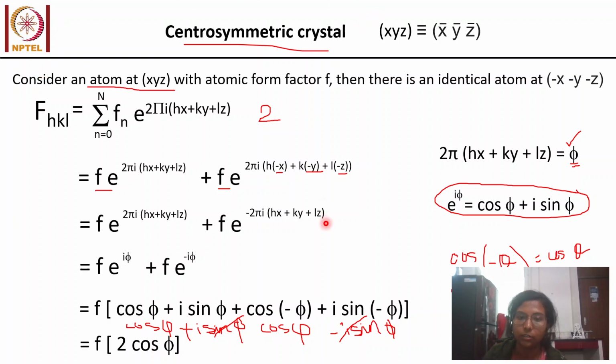No. See, these are two very different things. Any crystal, when taken under X-ray diffraction, has some HKL planes, so there will be some distance between the planes, the d.